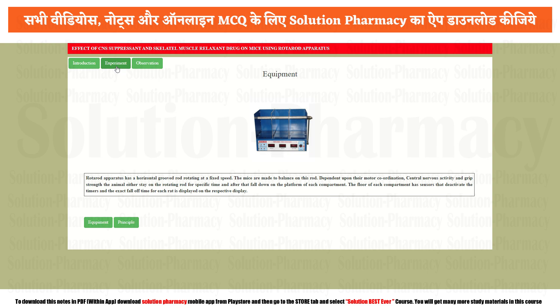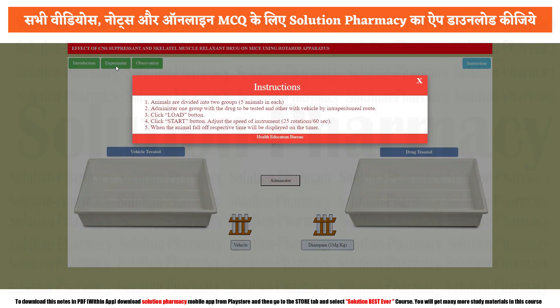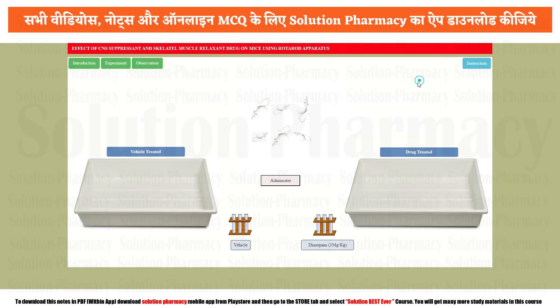So let's start the practical by clicking on the experiment tab. Once you click on the experiment tab, you will see a procedure. You can pause the video and take a screenshot to write it down. Then we close the procedure. The basic interface shows approximately six rats in two trays: a vehicle treated rat tray and a drug treated rat tray. When we administer the drug, the rats are separated into two groups — vehicle treated and drug treated.